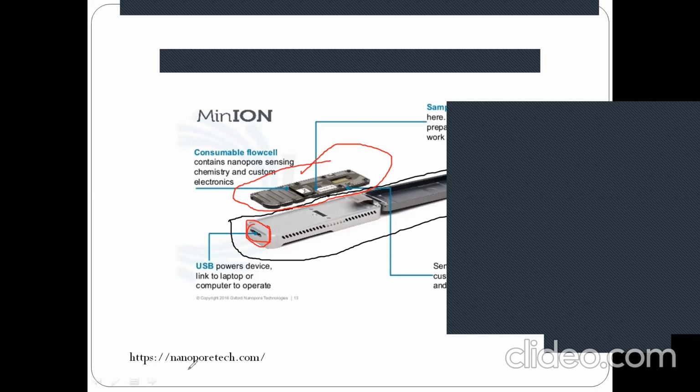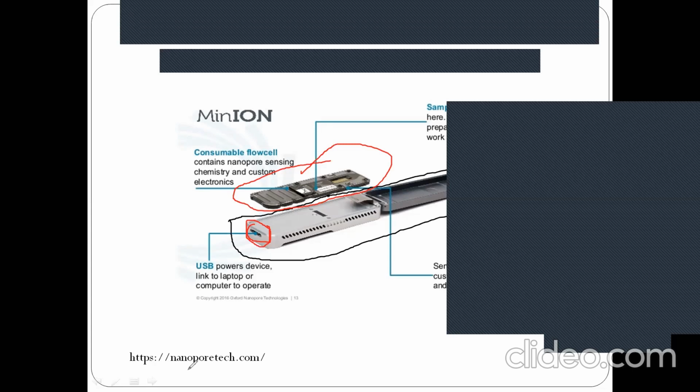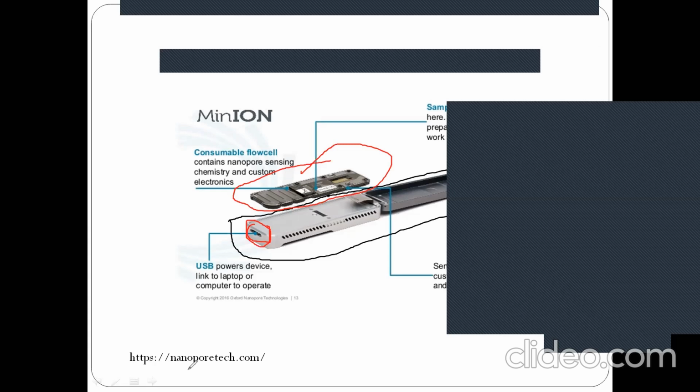In each and every case there are some advantages and some disadvantages. The advantage is that from 2012 to 2020, in 8 years they have dropped the total sequencing cost in a complete package to 1.5 lakh, which is really interesting. If your lab is only focusing on bacteria and you are not doing sequencing rigorously, maybe you have focused on one or two samples, maybe you are doing some research on one or two bacteria, you can go for at least 10.